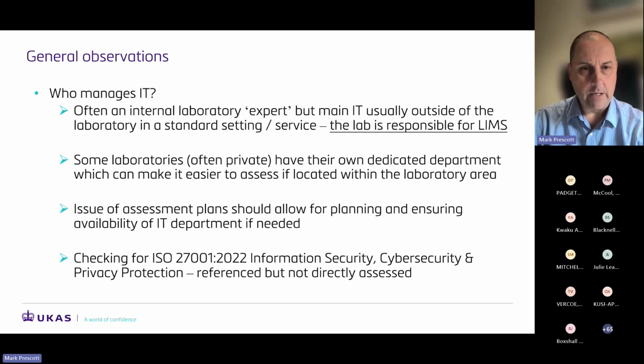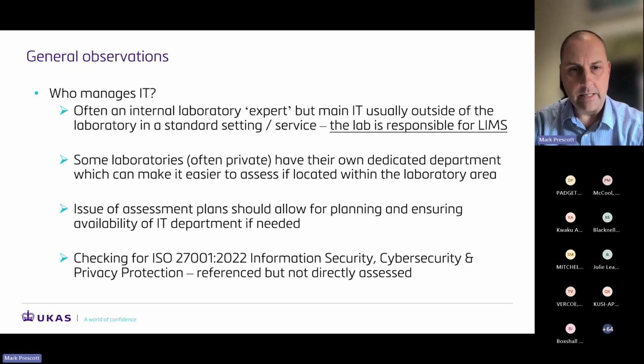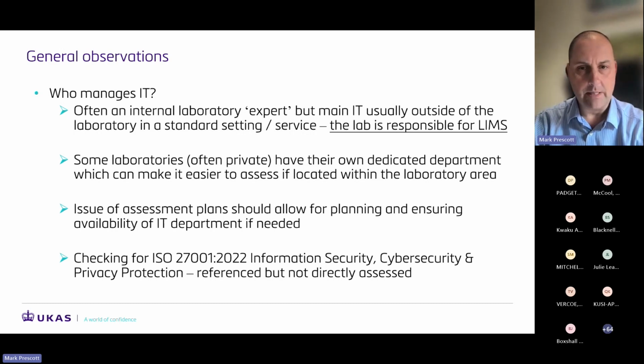Worthy of a mention is ISO 27001. I think some people get a bit scared of this. So this is a certification standard, not an accreditation standard. It's all about information security, cyber security, and privacy protection. And similar to ISO 15189, this was updated in 2022 as well. It goes a little bit further now, because obviously we've had issues in the last few weeks around cyber security. So there's a lot more focus on this now.